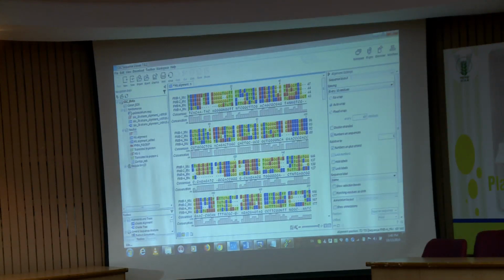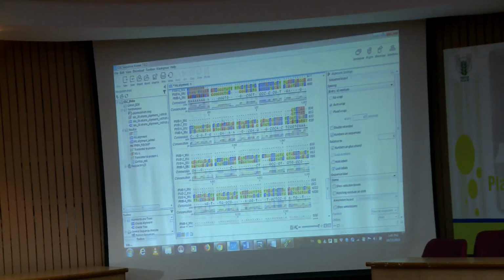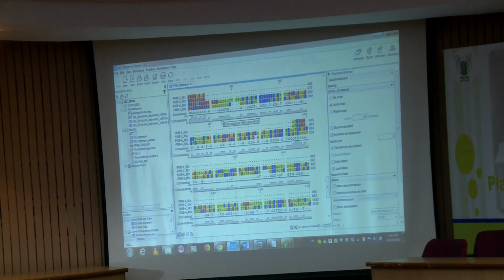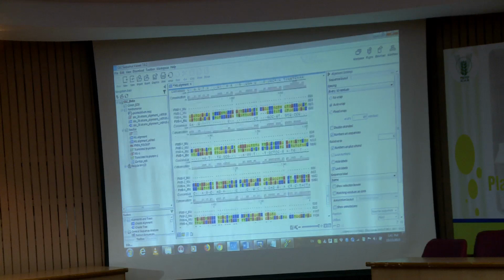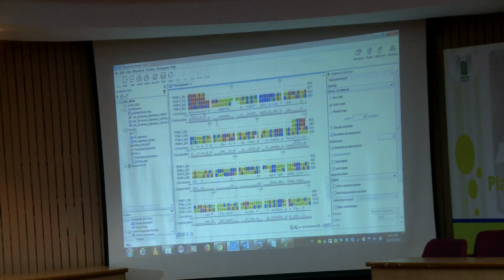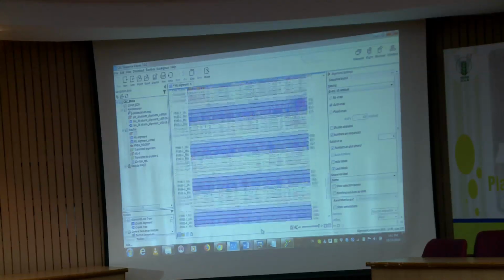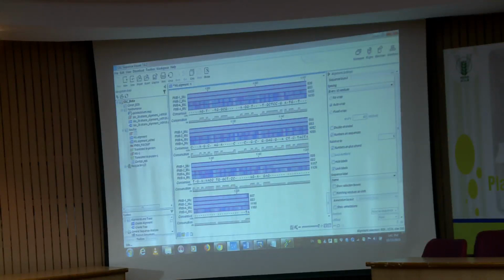The same thing happens in the 3' region also. Can you see, after a certain length, only 2 samples are getting sequenced, but in the others the sequencing stopped, right. So, I will again select the whole thing, right click, delete selection.